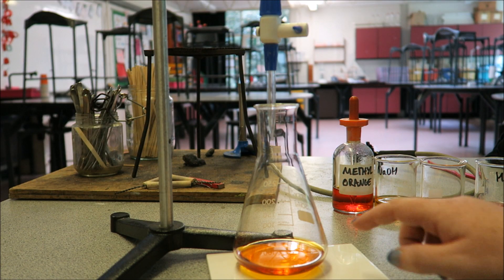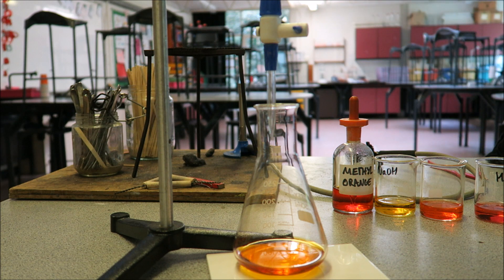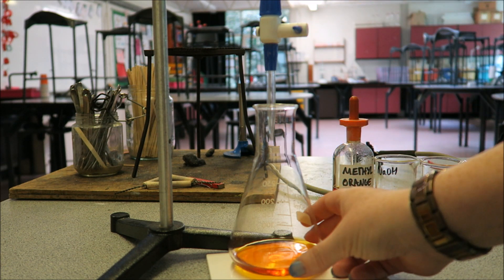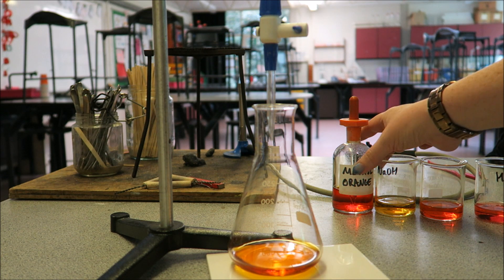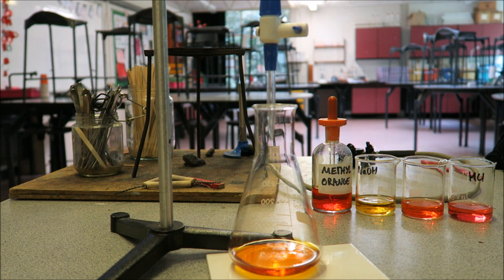Here we have our titration set up. We have our conical flask on our white tile so you can see the color change. Our burette with the acid in. What we are going to do is slowly let it out until we get to our endpoint, which we can see over here.